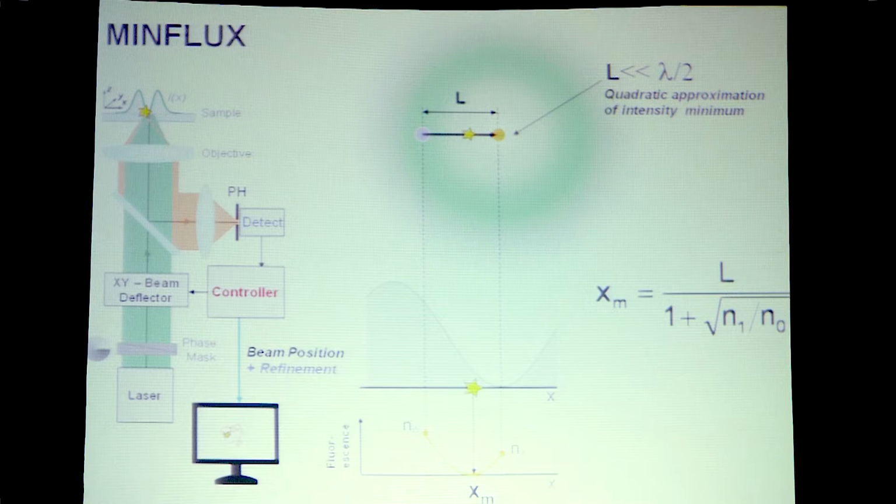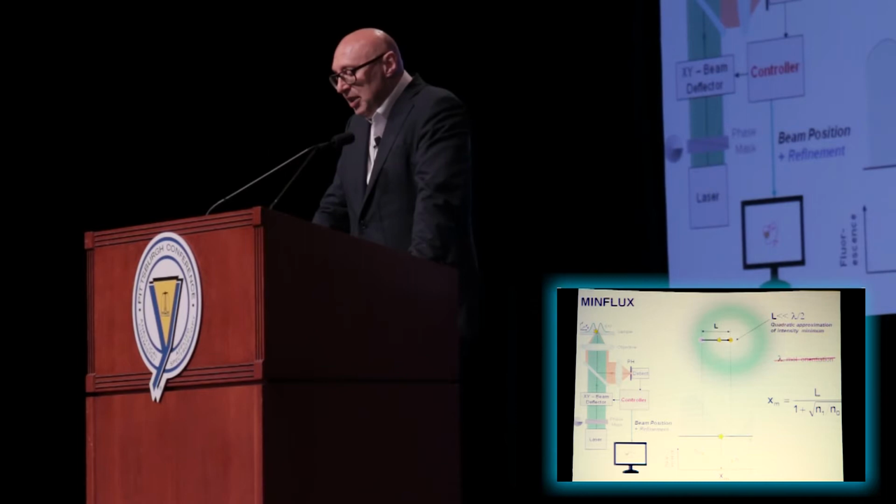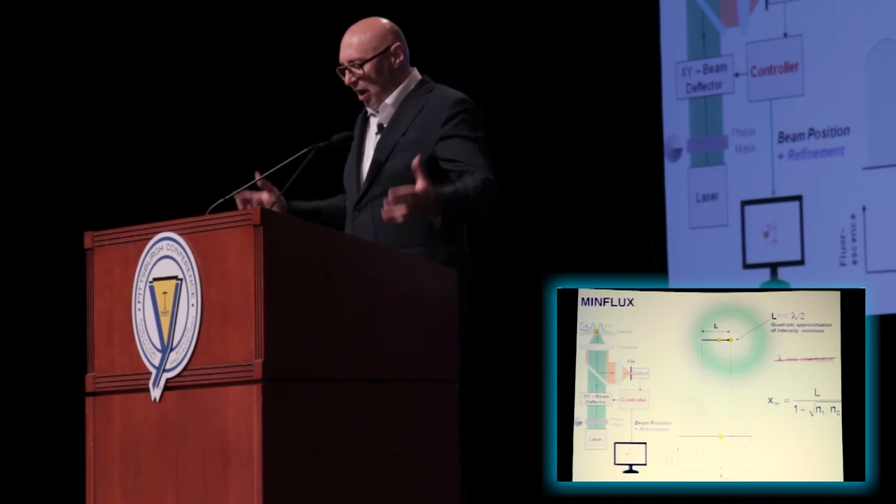And this is actually quite illustrative, simply because the simple equation tells us there is no wavelength dependence. If you look at it, you see the position of the molecule depends on that range L that is not wavelength dependent, and the denominator also doesn't contain the wavelength.